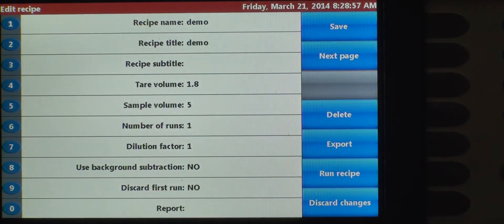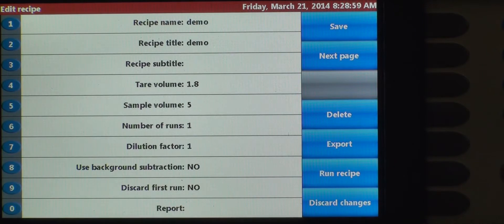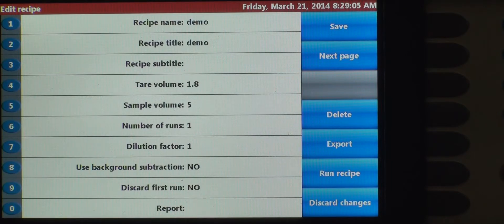Now also, to get away from using the alphanumeric keypad, there's a USB port on the front of the instrument, which enables you to plug in a USB keyboard. So if you want to create recipe names that way, you can certainly do that.